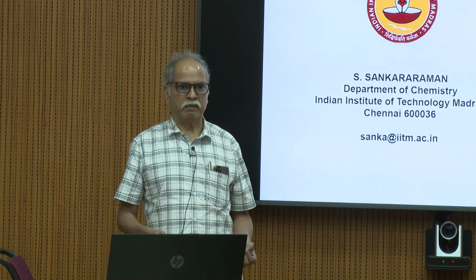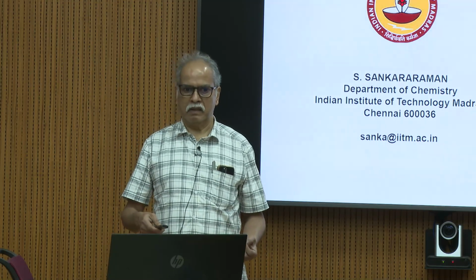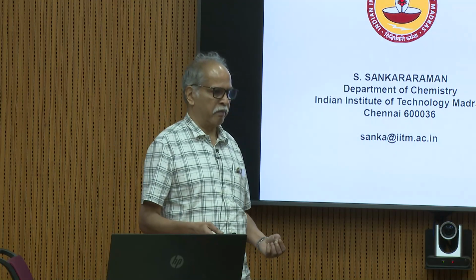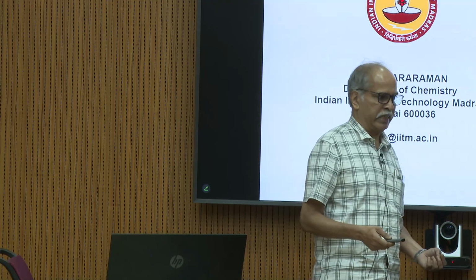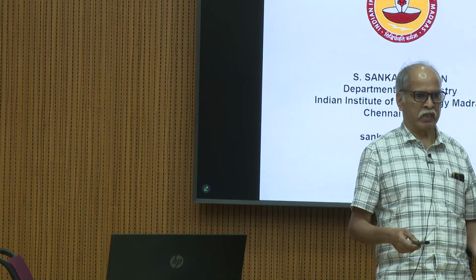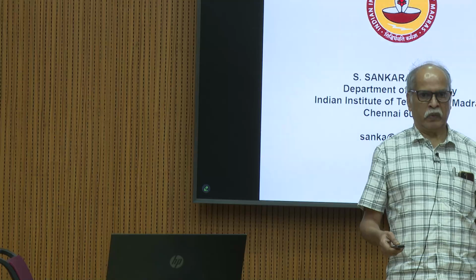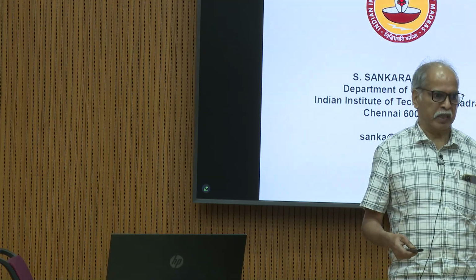If for any reason a molecule is undergoing a process wherein hydrogen positions are exchanged, for example, the OH hydrogen, if you take, the OH hydrogen doesn't stay on one oxygen all the time, it hops around from one oxygen to another oxygen and so on. How do we know this? If you look at the NMR spectrum, the OH peak will be a broad peak and it is generally exchangeable to deuterium and so on and so forth.